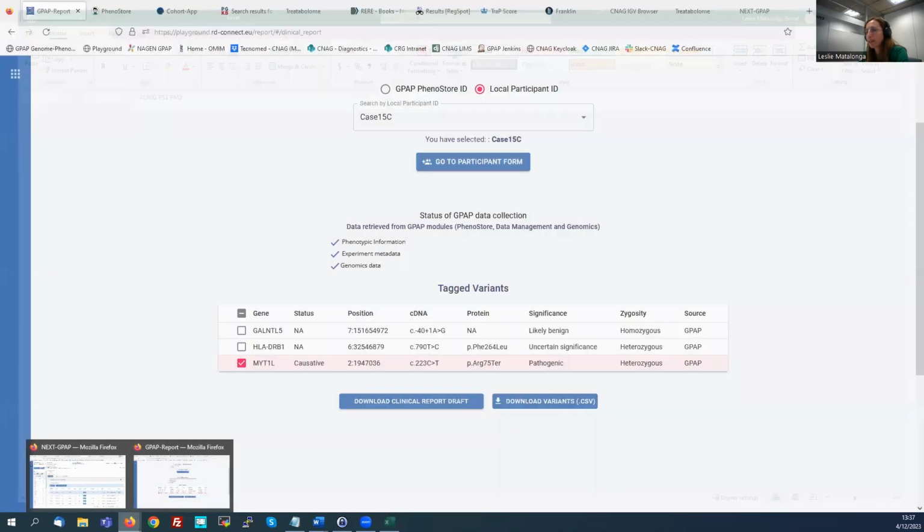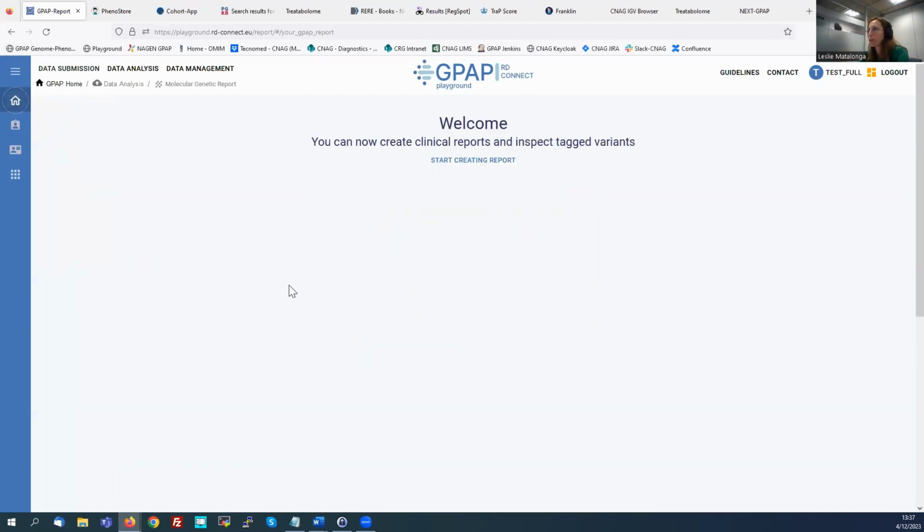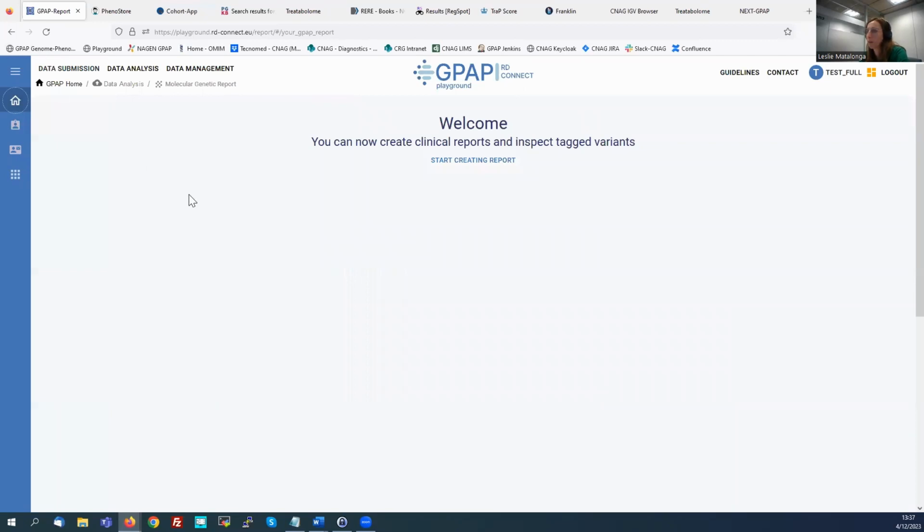So I think more or less I've shown all the new functionalities we have in the system.